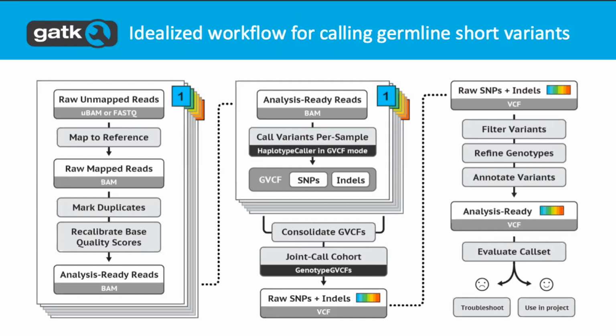Yeah, so we use the same pipeline, and it does mean that sometimes by the time you're sequencing your 50,000th genome, the tools have evolved. We still use the older version, or we decide the change is big enough to reprocess everything with the latest. But it is true that the big advantage of GVCF is that you can do that incremental processing. But we really don't recommend mixing versions within the same project, just because of the risk of batch effects.